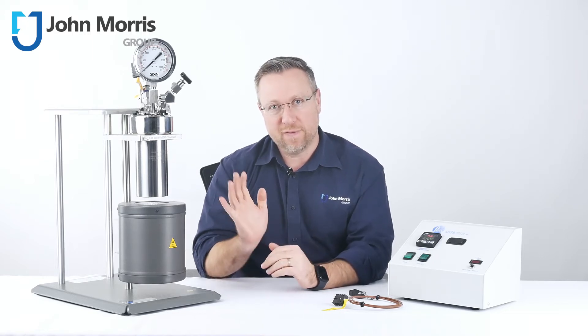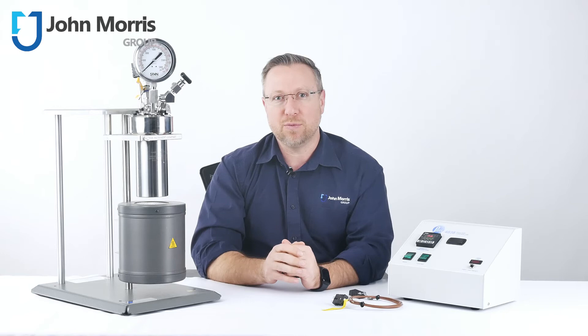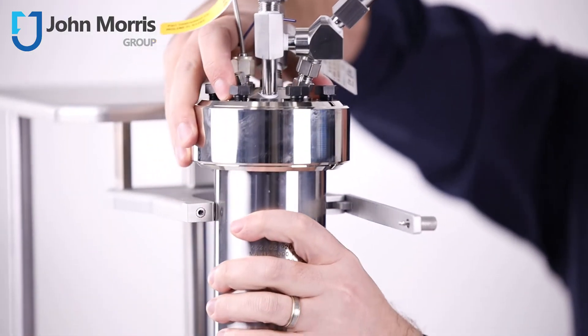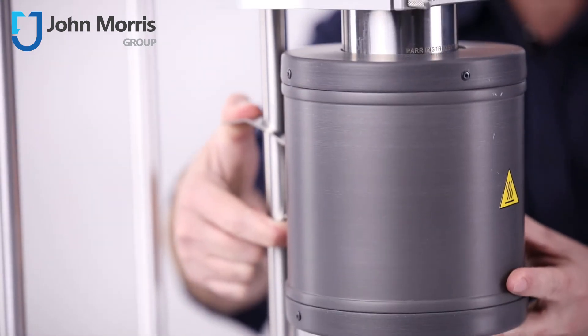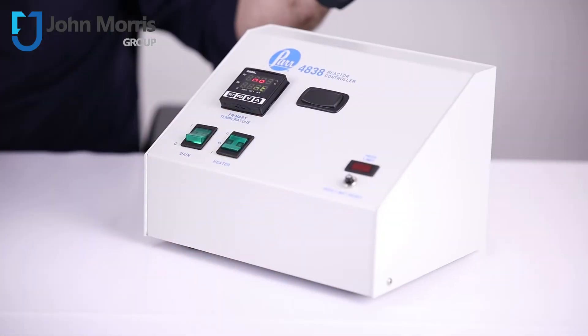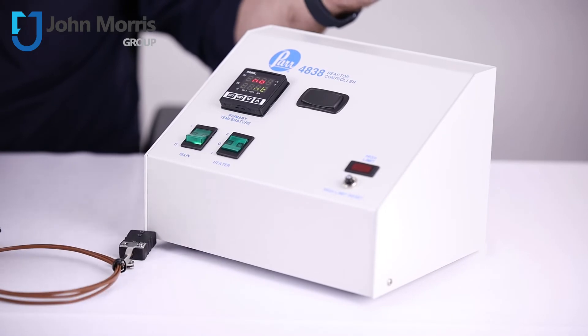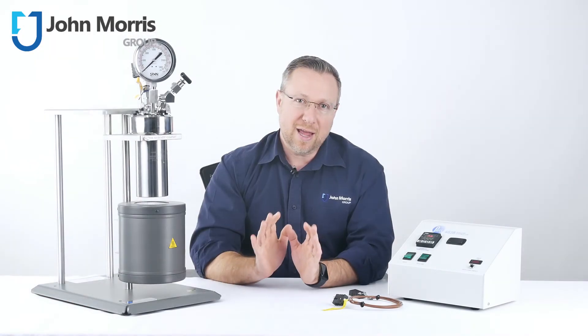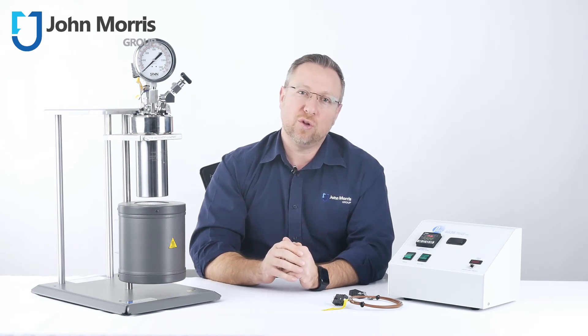The compact design of the 4760 series enables the entire setup to be safely housed on the included metal frame, which also supports the heating mantle for convenient positioning. The 4838 controller included with this system is designed to monitor and precisely control temperature within the reactor. The entry model controller can be expanded to include optional pressure or redundant temperature modules.